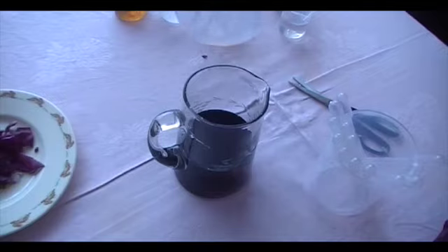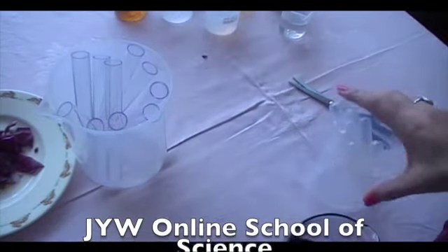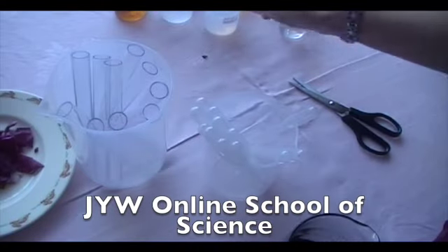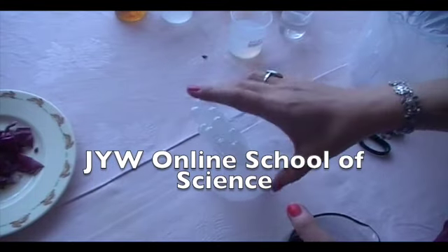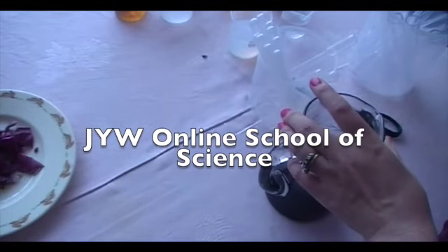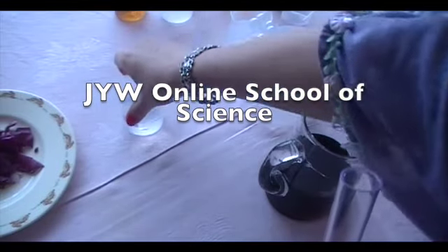I have some test tubes and I have some droppers, and what I do is use, say for instance, this one, white vinegar.